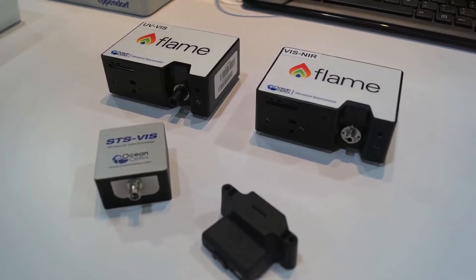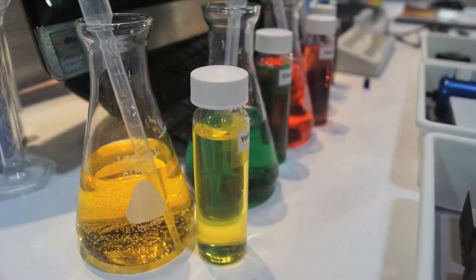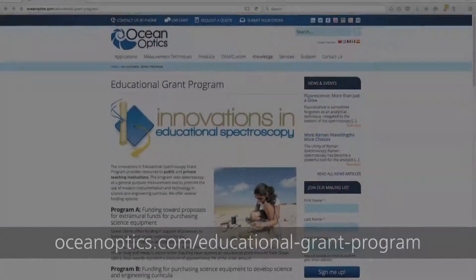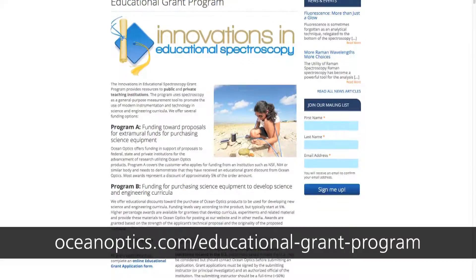OceanOptics offers a line of robust, easy-to-use spectrophotometers and accessories that can be mixed and matched to design a wide range of experiments in chemistry, biology, physics, geology, and engineering. We even have an educational grant program to help defray the costs of setting up your spectroscopy lab.